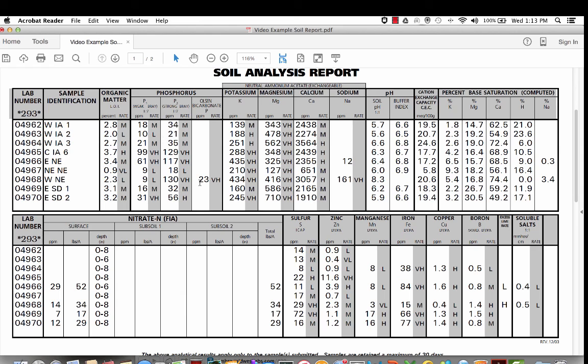Again, when we run the Olsen, what we're looking at a lot of times is whether a basic soil may have neutralized the extract solution for the P1 Bray. And when we think that might be the case, we will run this Olsen bicarb test. And in this sample for western Nebraska, that was true: the P1 Bray had been neutralized by the basicness of the soil, so we ran the Olsen and found out that there's quite a bit of fertility that was not being shown by the P1 Bray, although the P2 Bray also gave us a clue that that's what was going on.